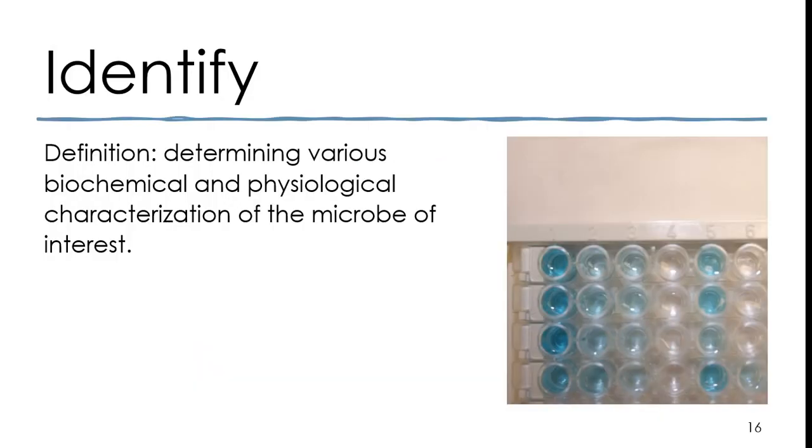So once you get through that process, the purpose, of course, of the 5 I's is to identify the microbes. After you have grown it and you believe you've got a pure sample, you then go through that identification process, and that's generally going to be done through biochemical and physiological methods. In many cases you're going to use experiments or assays such as the ELISA, DNA analysis, etc. And through those processes you're going to be able to identify that specimen.